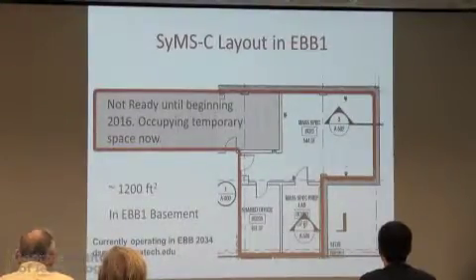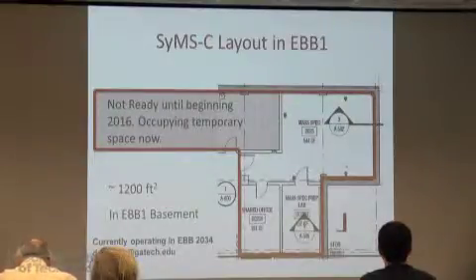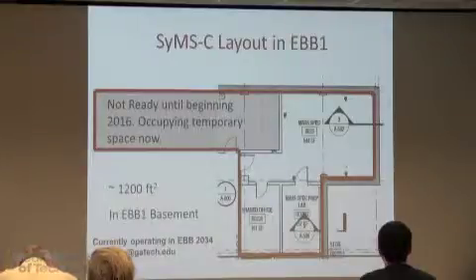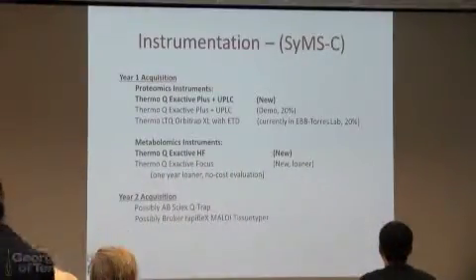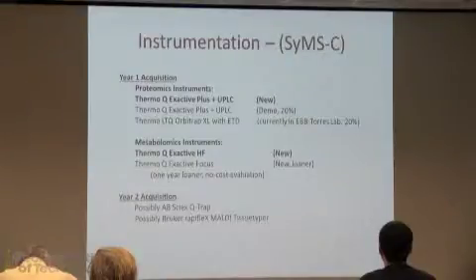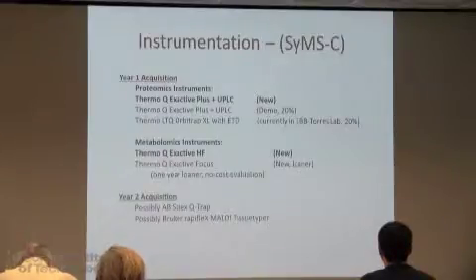But right now we are operating on temporary space that was given to us for 6 months. The room is 2034 in EBB. And the manager of the core is here, David, so he's the point of contact, but I'm happy to help you with this if you have any questions. We're very lucky that the Institute has invested in some instrumentation for doing this work. We have a suite of instruments. These are all mass spectrometers that are used for measuring different molecules in different types of samples. There are different kinds of mass specs because we want to determine either proteins or metabolites, and so they are tailored. It's like a bike. You can have a road bike or a mountain bike. They're both bikes, but you're not going to go on a mountain trail with a road bike. You can try, but it's not going to work.